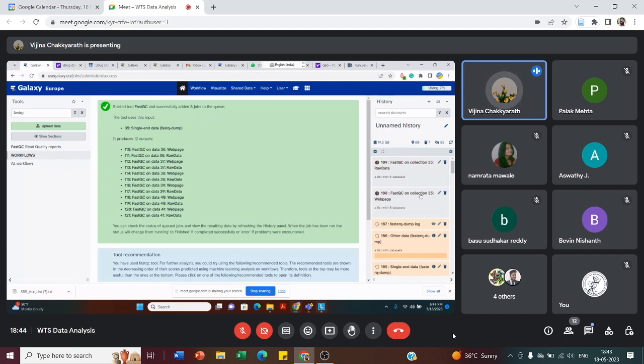If you click here, you will get that, I mean a list of data. How many in total did we download? 6 data, right? So you can see here the raw data. The result will be in a web page, I mean the graph and all, you can see in this FastQC collection web page.